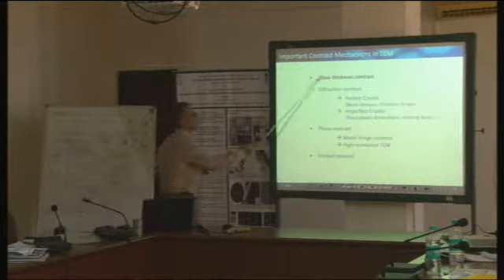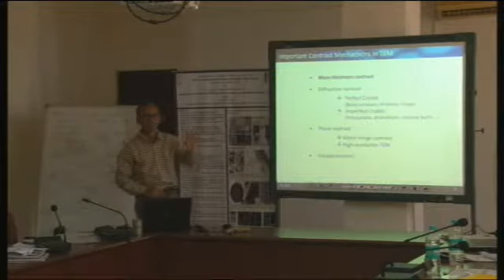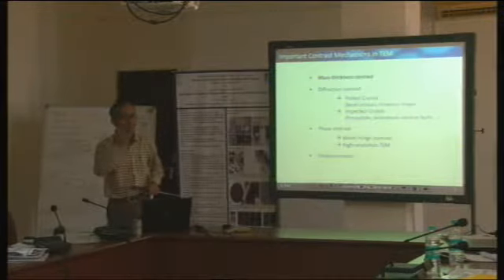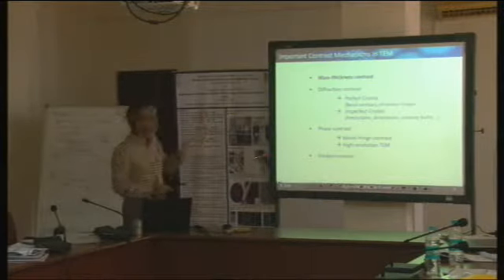So the first is mass thickness contrast. It's actually very easy and straightforward to understand, and it will be more or less a repetition of probably things that you already know. I would say it's very common sense to understand that. That's not a big deal.